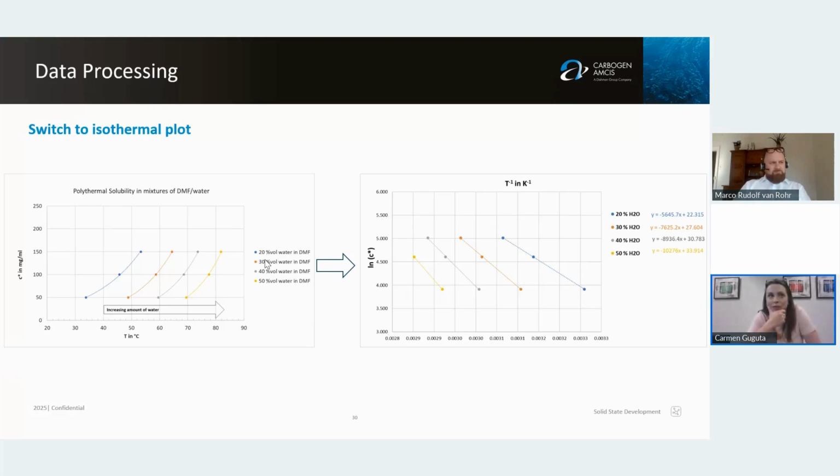And definitely in the third version of the Crystal16, the latest one, the reactors are designed in such a way that you have a colder upper part that will prevent this. The same is also the Crystalline version 2 design.